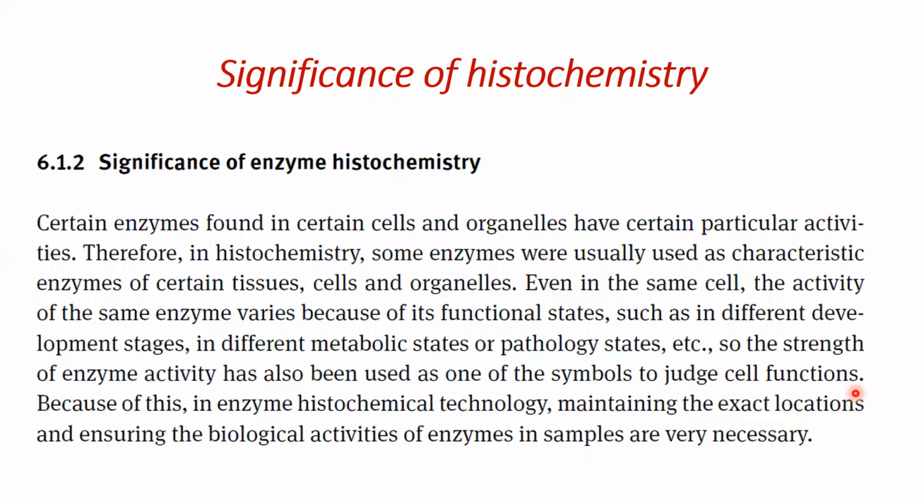Because of this, in enzyme histochemical technology, maintaining the exact locations and ensuring the biological activities of enzymes in samples are very necessary. For example, cancer cells will use more enzymes compared to normal cells, because they are rapidly proliferating and highly energy consuming.